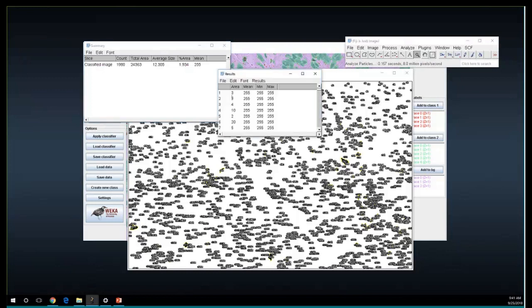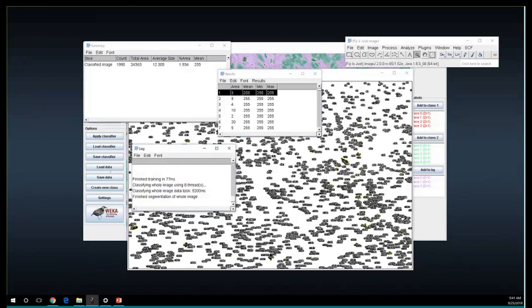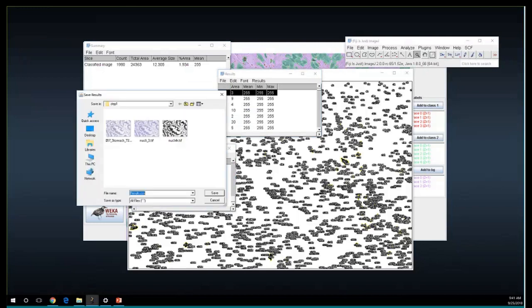So there are tiny pixels or tiny particles, and we can get rid of these by estimating what a real small dot or single dot size will be by just eyeballing the original image and visually estimating that particle. But first, what you want to do at this point is save your results as an Excel sheet or a CSV file. Let's save it here. Step 2.